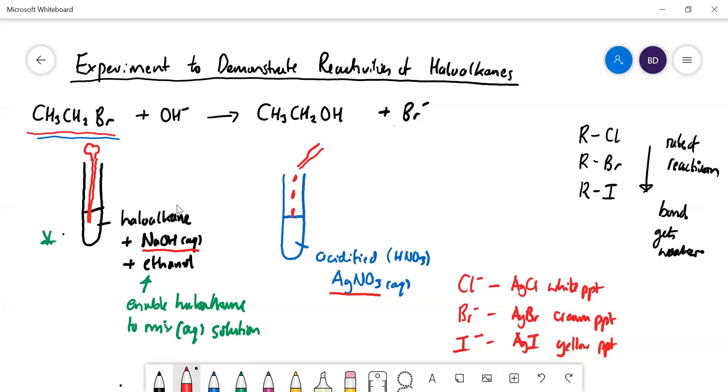Now why do we need to acidify it? Because don't forget in this tube we've got NaOH and that needs to be neutralized, otherwise that's going to form a precipitate with silver - silver hydroxide. That's why you add nitric acid to get rid of that. Now if you have released any halide ion, then that is going to react with the Ag+ ions to form a precipitate.